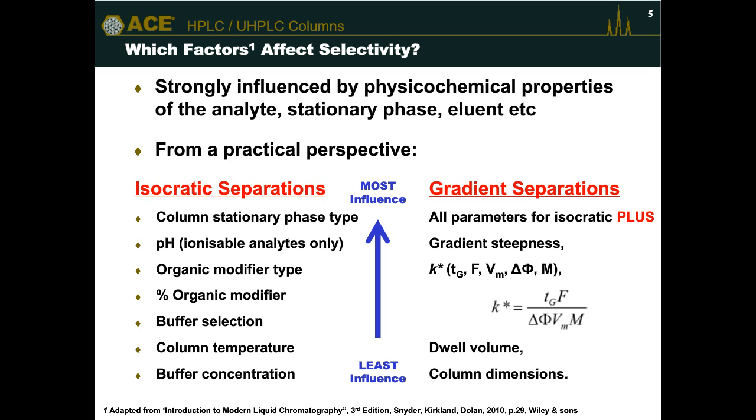Someone asks what I think is a related question on selectivity. How can someone tell if a peak in a chromatogram is actually coming from coelution of several peaks? That is, what would you suggest to do to test for this, providing the peaks look fairly symmetrical?